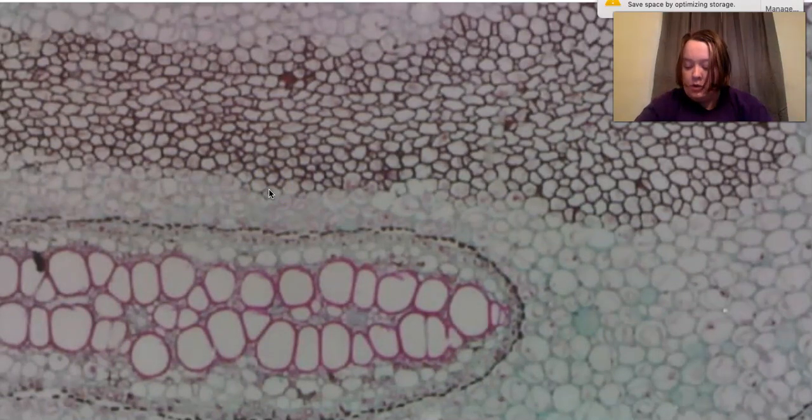question. So question number 2 is going to be, these are plant cells. I've told you that this is a plant cell. Technically, it's a fern, an invasive type of fern. What are 2 to 3 characteristics of plant cells that you see exhibited here?